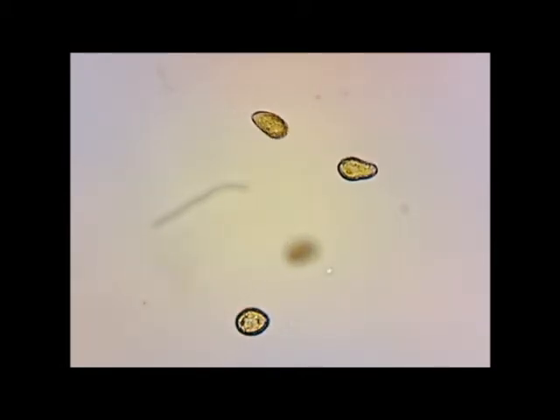If you look closely, you may see the flick of the flagella and also that they don't come directly from the top of the cell, but are inserted slightly below the top.